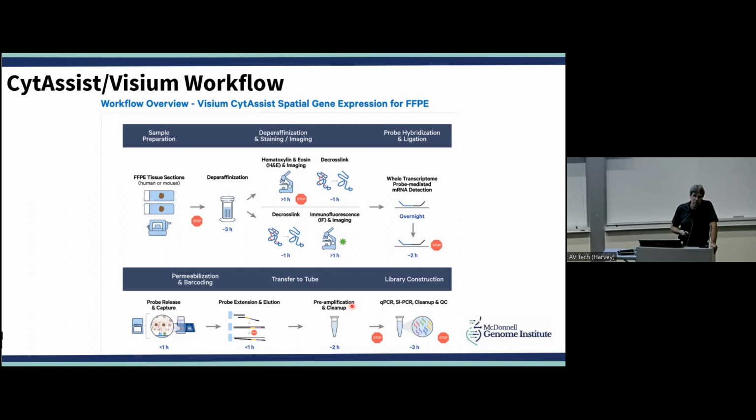With the new Illumina NovaSeq X Plus sequencers, we're expecting the 25B kits, which are really bringing the price way down, probably within the next month or two. Illumina still hasn't given us a formal date yet, but we're hearing rumors that it could be within the next month or two that we'll see those 25B kits, which will really help with the sequencing cost as well.